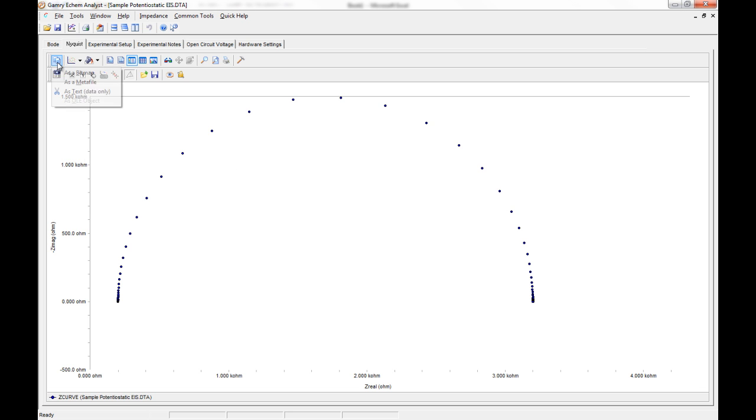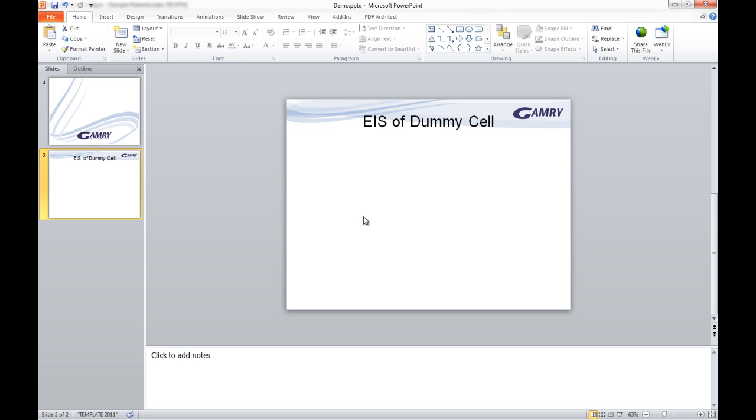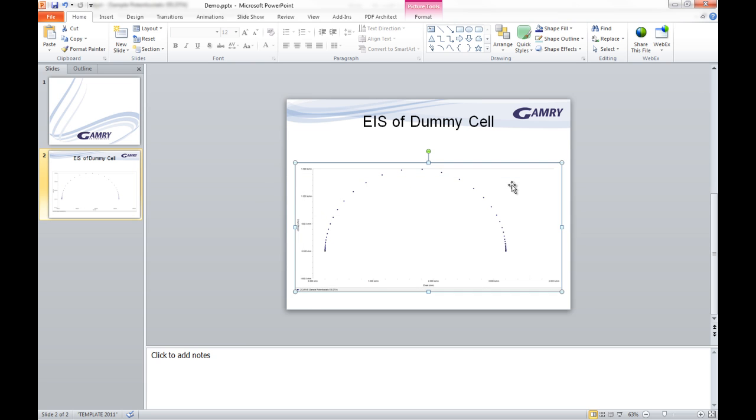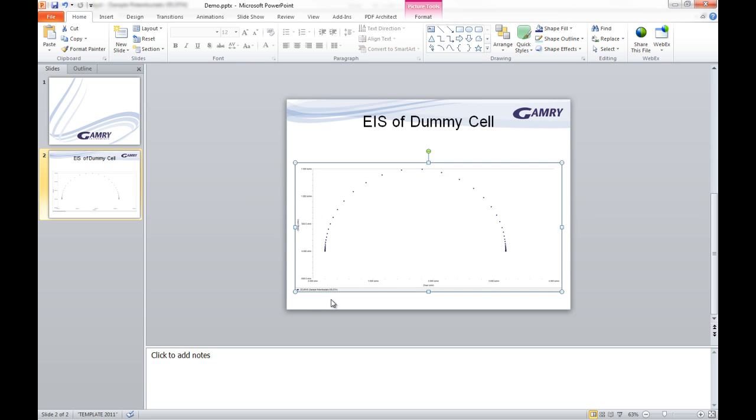And then you would simply click copy it as bitmap. And then you can paste it into something like PowerPoint. And we can see it pastes in very nicely, just like you saw in Ecamm Analyst.